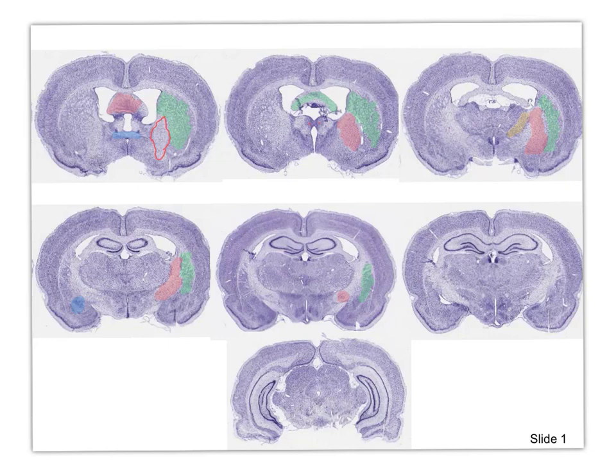And there's a controversy in the field. Most people more or less ignore it. It's really hard to study because it's surrounded by white matter, very important white matter tracts that are also involved in motor activity. And so it's hard to study. Although I just did see a paper from 2017, you can start teasing out genetic subtypes of cells in there, and then use either promoters or transgenic animals to start looking at it. So that's an interesting thing.